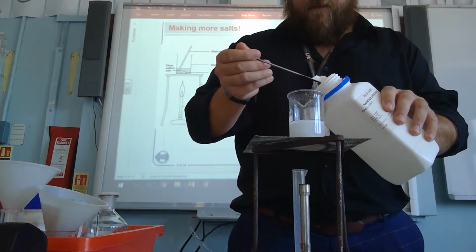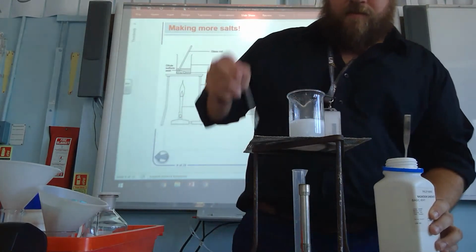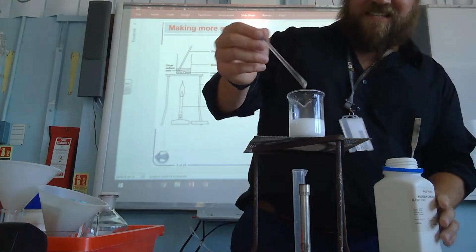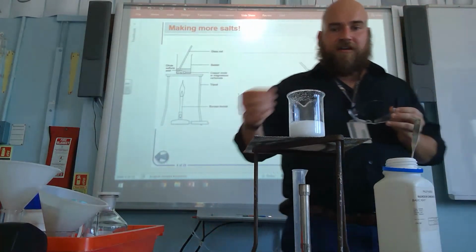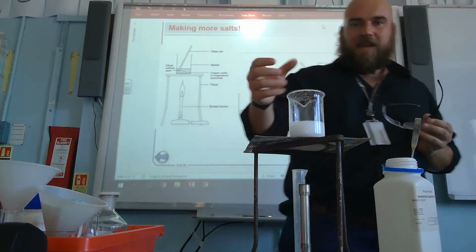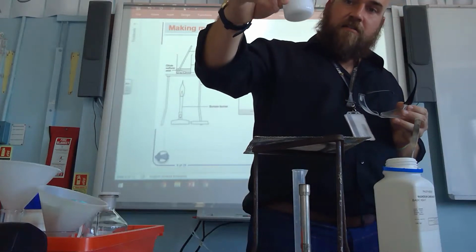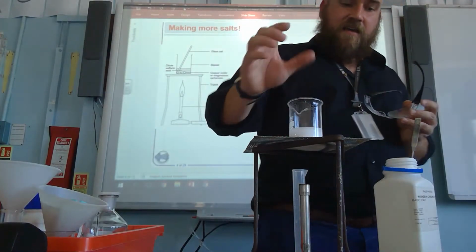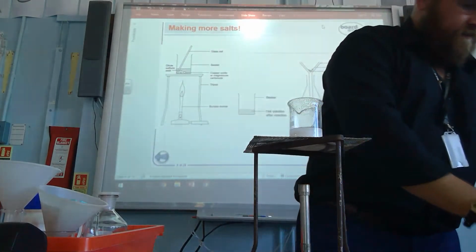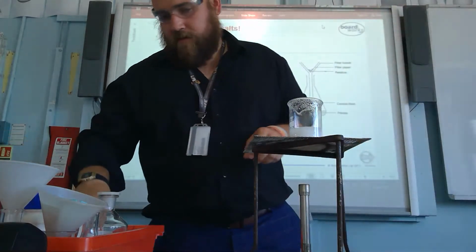So again, yeah, that's not fizzing much at all. Put a big glug in. And you can see it's staying white now, which means that the solid isn't reacting. It's just sort of suspended in the solution, a bit like milk. So if I leave it a long enough time, it will separate quite nicely. Yeah, so you can see it's no longer colorless, which means I've got quite a bit of excess there. So what I'll do now is I'm just going to heat the acid. Okay, so I'll just put this out of the way with a Bunsen flame.